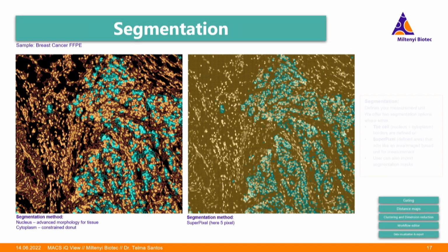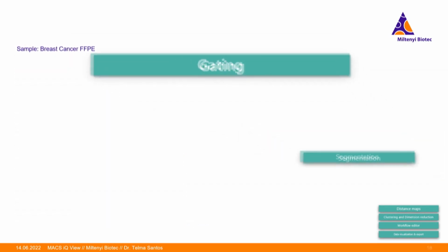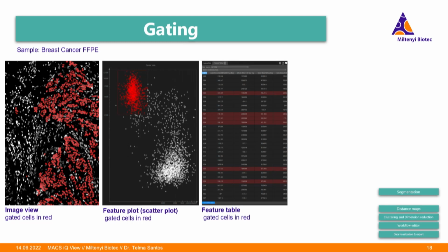So now, just to give you some nice pictures, because this is also very important for microscopy to see actually the tissue, but also then the next step is to make meaningful statistics so that you can show significant differences between untreated or treated or cancerous tissue or non-cancerous tissue. So this is a segmentation method, and then we can do gating with this. This is basically the tissue, but each data point or every single dot over here represents a cell, and then you can make those gatings out of that.